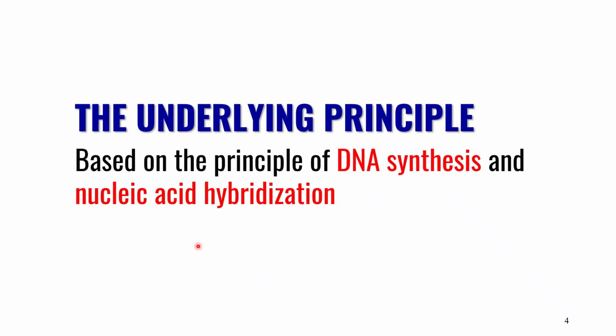So the underlying principles: it is based on the principle of DNA synthesis and nucleic acid hybridization. DNA synthesis is the same as DNA replication. Its requirements are more or less the same. And nucleic acid hybridization here refers to the binding of two complementary DNA strands. In PCR, it refers specifically to the binding of primer with its target DNA. So you should be able to identify when and where DNA synthesis happens and when and where nucleic acid hybridization occurs.